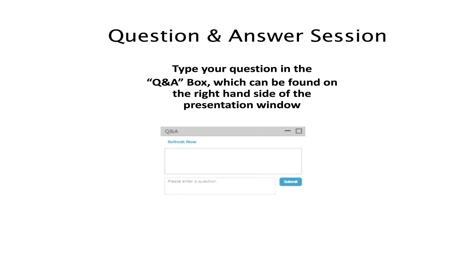Now, the alternative sample preparation approach that I've seen for analysis of laminates is with our Spotlight 200 infrared microscope. And just as a reminder, the Spotlight 200 incorporates an automated stage as well, but it's a single point detector in the system. And so for each stage position, the system is measuring a single infrared spectrum. Now for samples like laminated polymers to be analyzed on the Spotlight 200, I've seen customers cut a sample at an angle so that it is sort of a cross-sectional analysis but with angular interfaces.